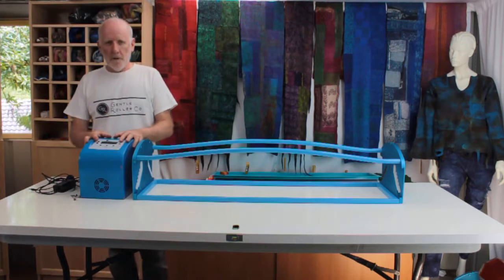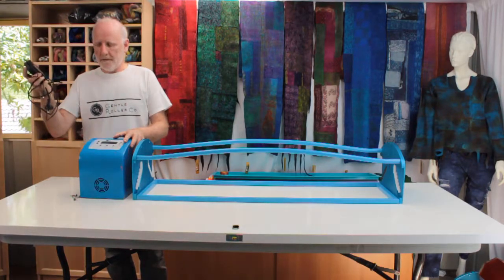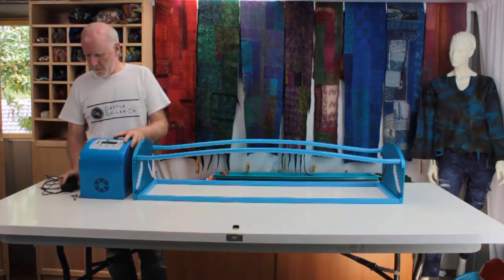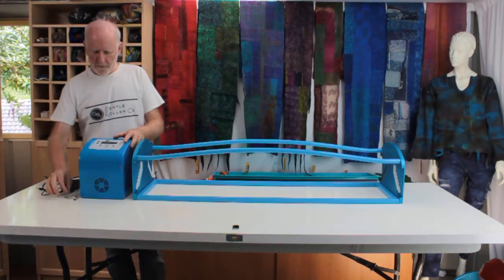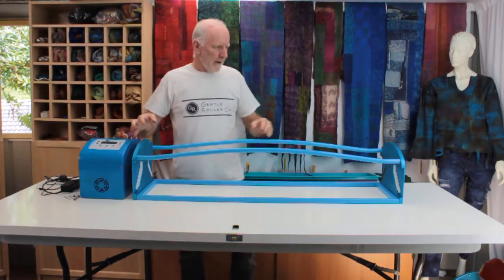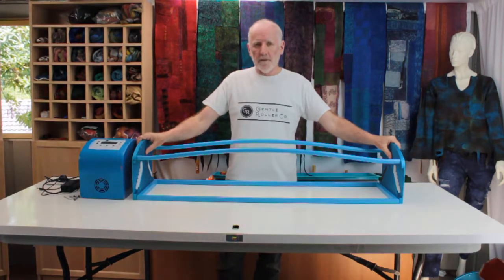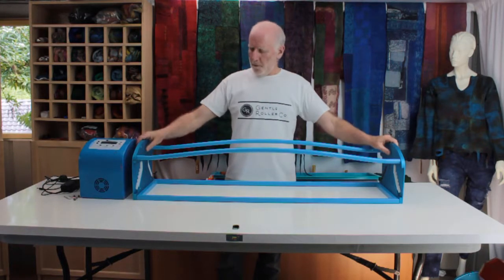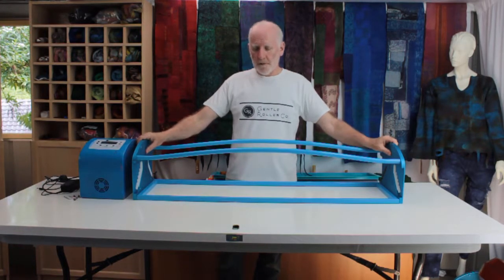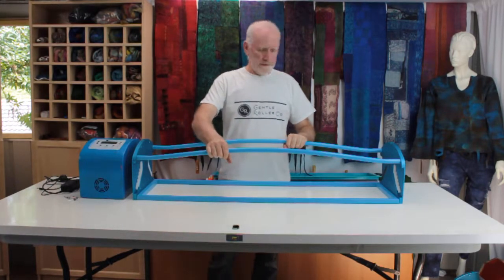The smaller carton contains the motor housing, a power pack similar to a laptop computer power pack, and four screws. The larger box contains all of the components of your roller assembly. I've stripped them all away so I can introduce them one at a time, the main component being this cradle or housing.